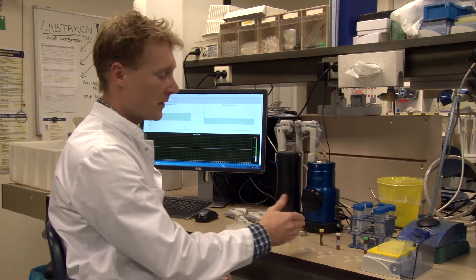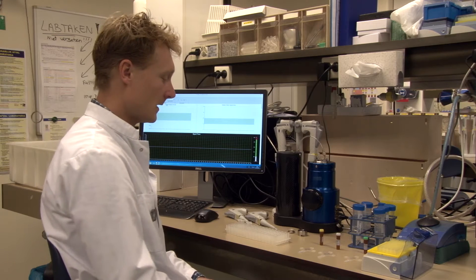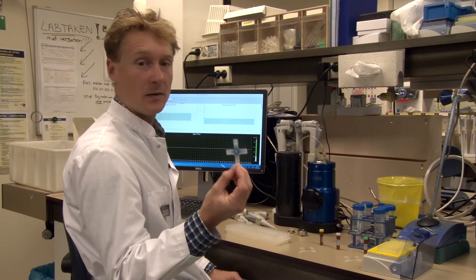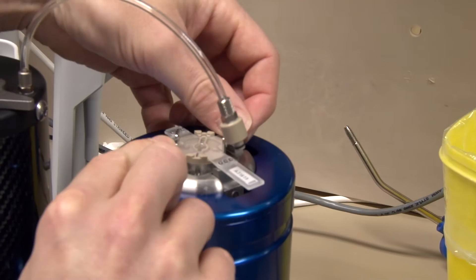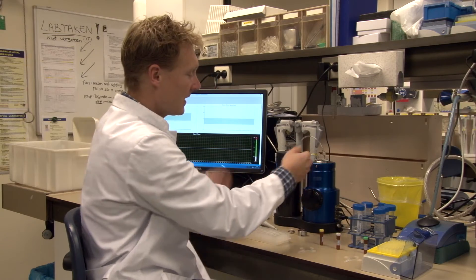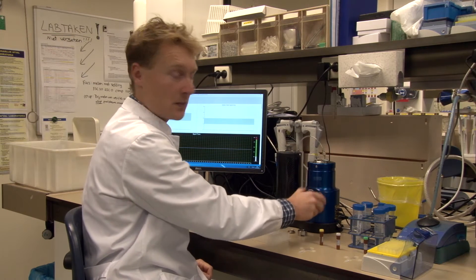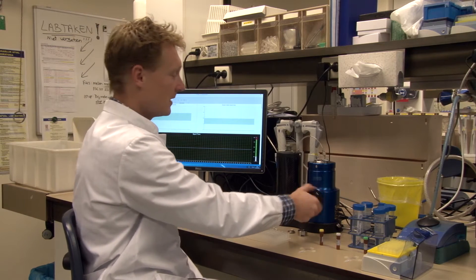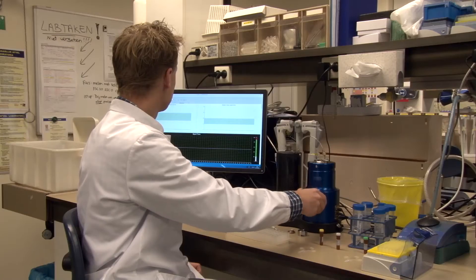For each of these pores, we have different reference materials for calibration. First, I will start by attaching this nanopore onto the Qnano. You can see four clamps — it fits perfectly on those clamps. By turning this wheel, I can stretch the pore and change the pore diameter. At 45 millimeters stretch, the settings are optimal for our sample, so I'm turning to 45 millimeters.